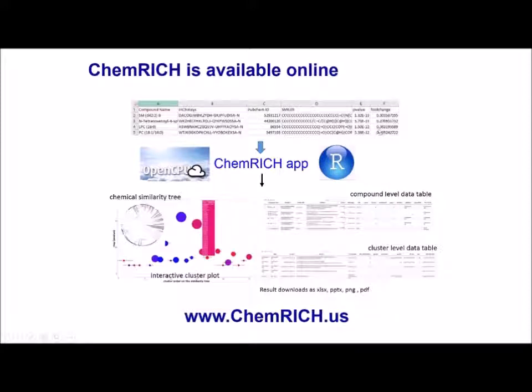At the moment, ChemRICH allows only one statistical comparison. I'm writing an R function that will allow, if you have more than one statistical comparison, to perform ChemRICH analysis in one step.